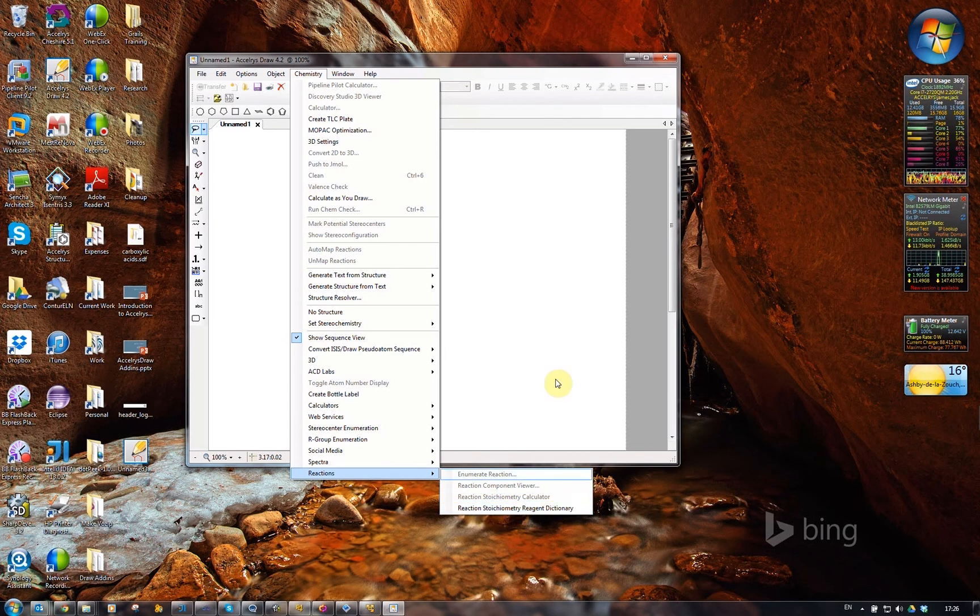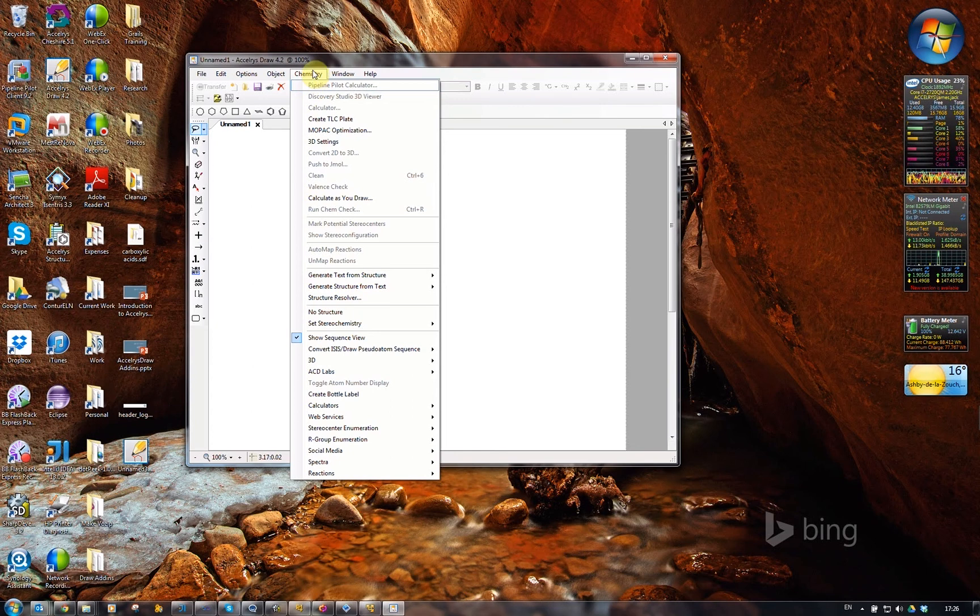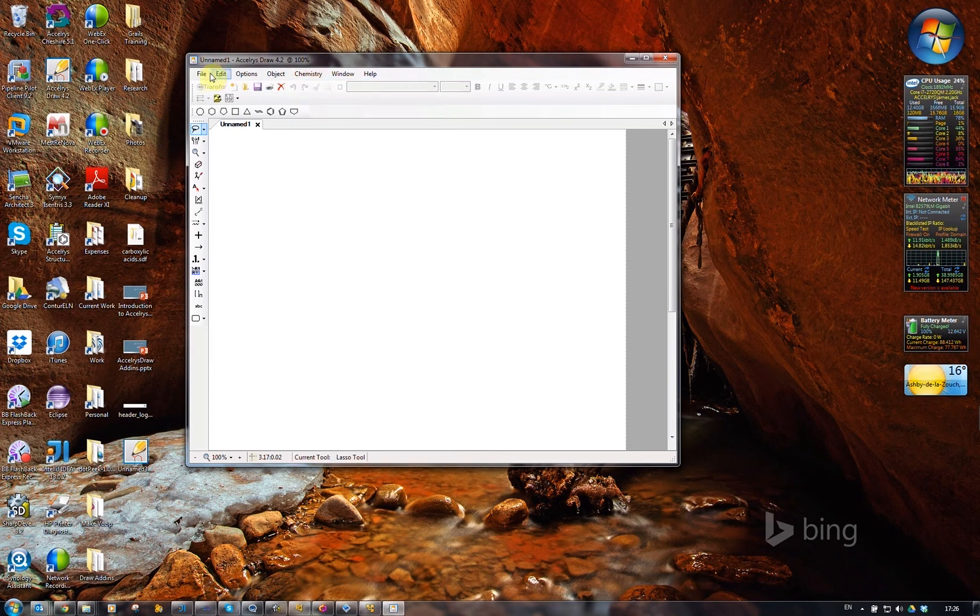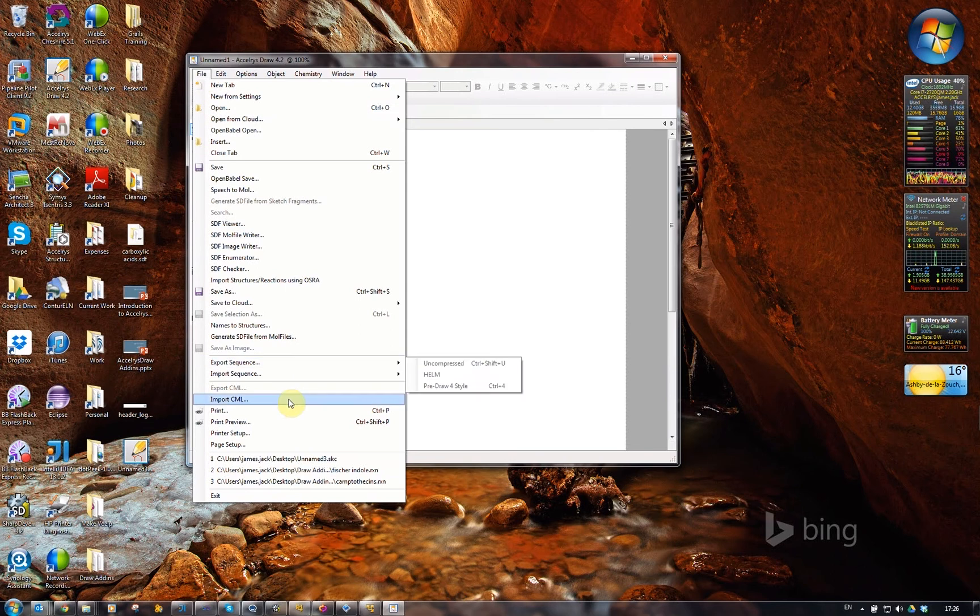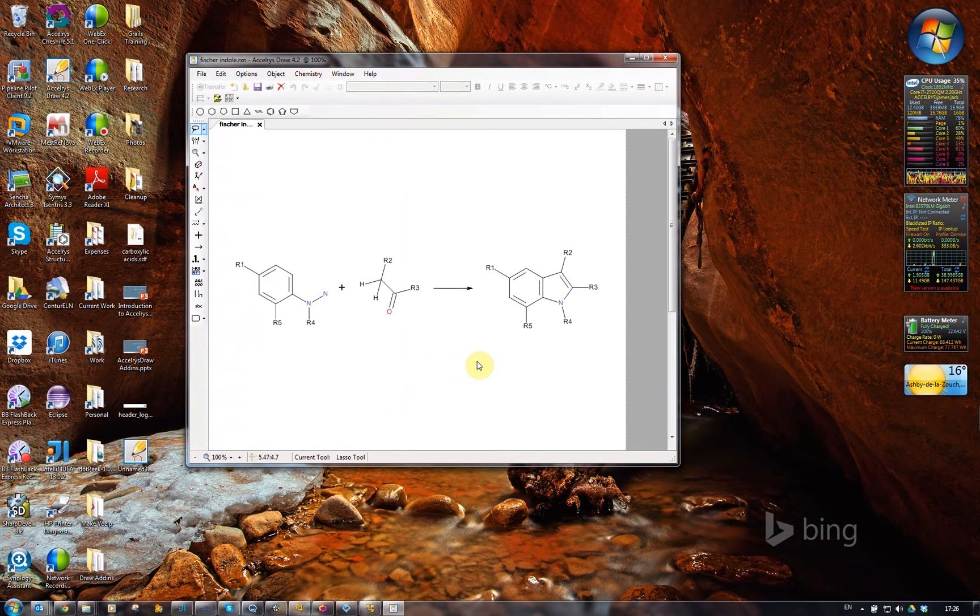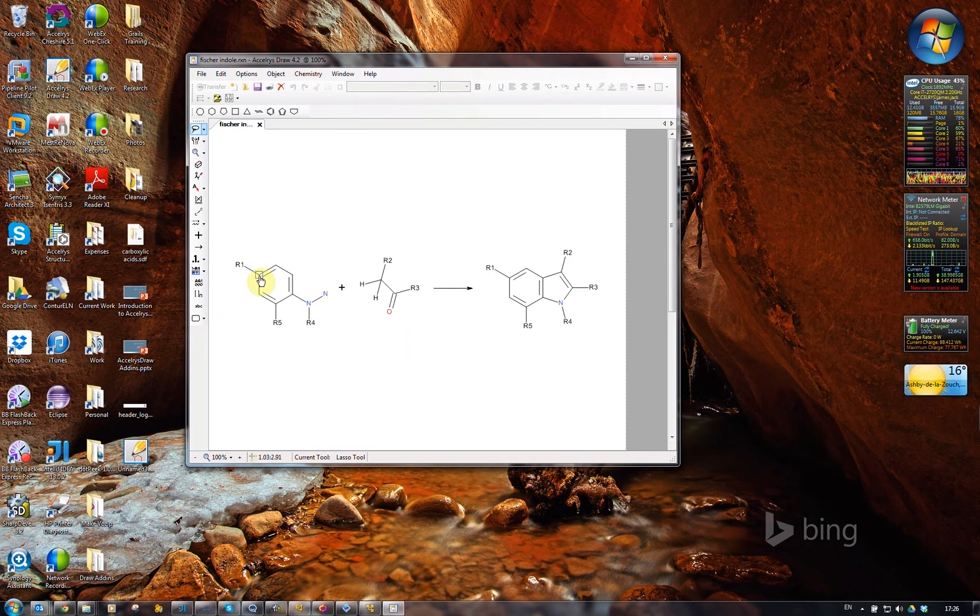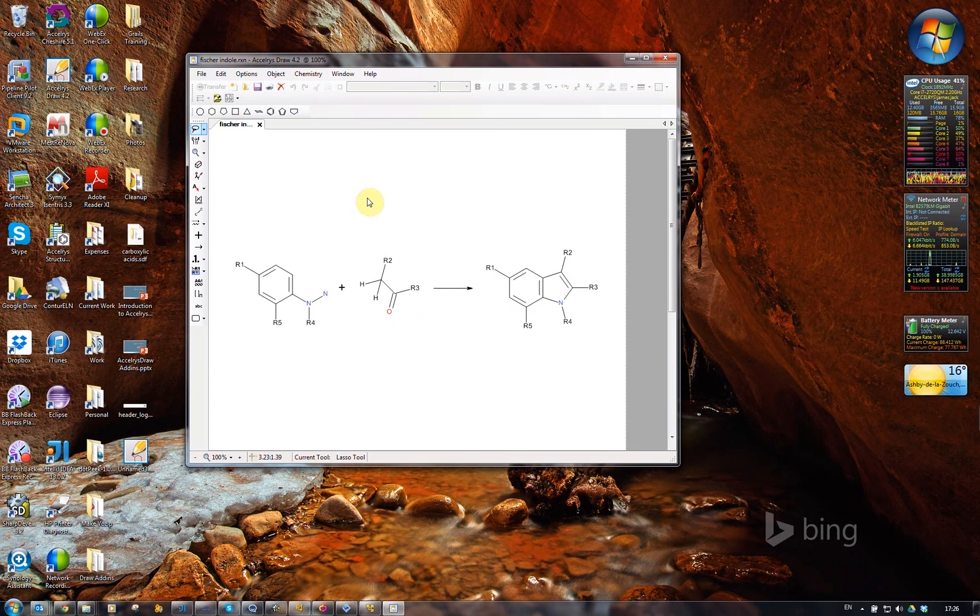I'll start off with the reaction enumerator. I'm going to open up an existing reaction, one that needs to be enumerated. It's got R groups defined in it. This is a Fisher-Indole synthesis.